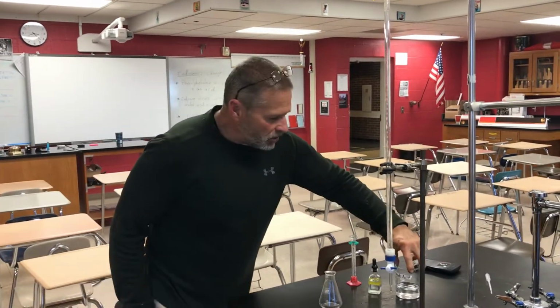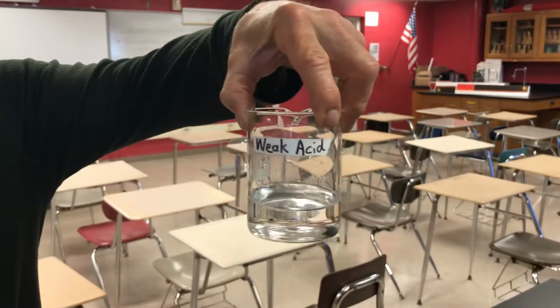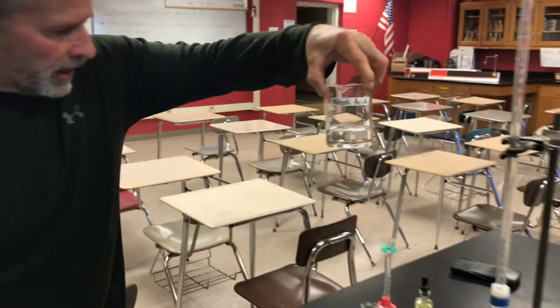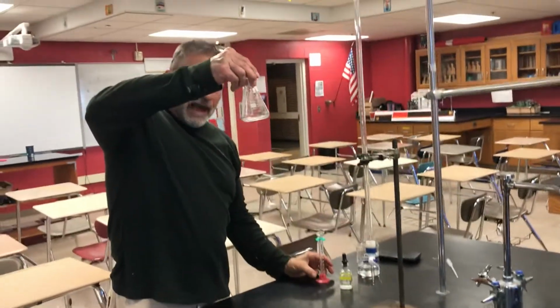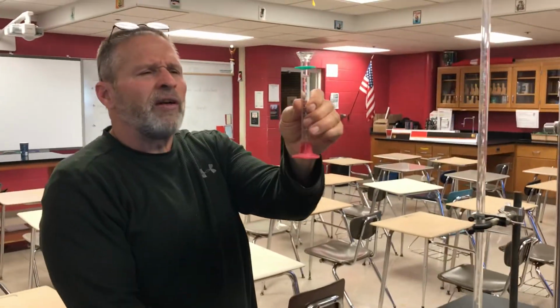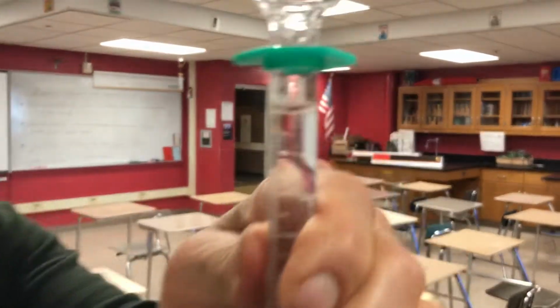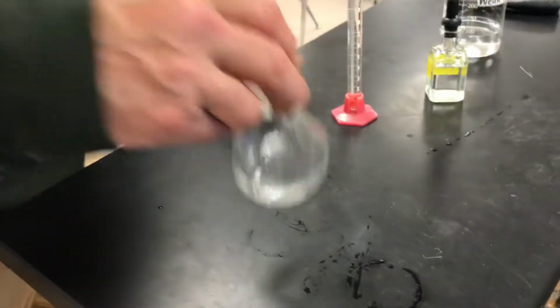We have an unknown weak acid we're going to titrate. So, typical setup. I've got my flask, my reaction flask. I've got my weak acid measured out already, 10 milliliters exactly of my weak acid. And we have our phenolphthalein.